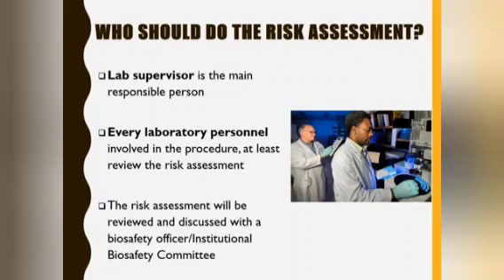Who should do the risk assessment? The laboratory supervisor is the main responsible person. Apart from him, every laboratory personnel involved in the procedure must at least review the risk assessment. The risk assessments must be reviewed and discussed with the biosafety officer or institutional biosafety committee.